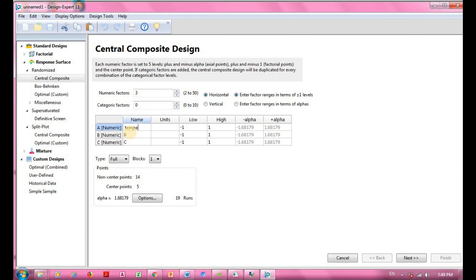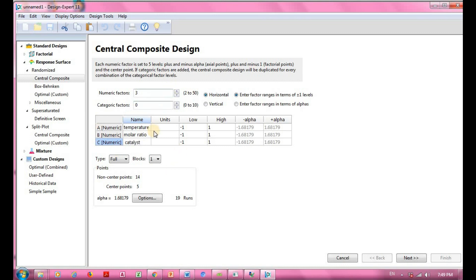Factor A will represent temperature, factor B will represent molar ratio, and factor C will represent the catalyst used in my experiment.